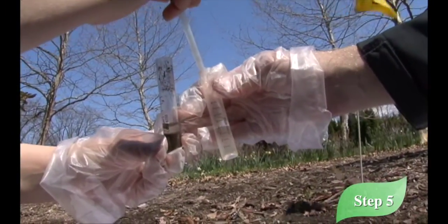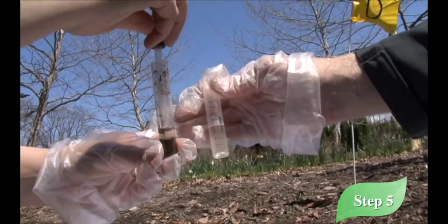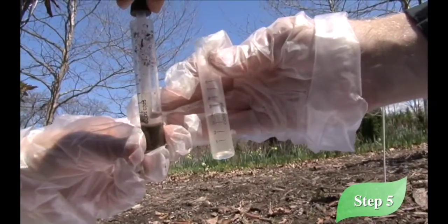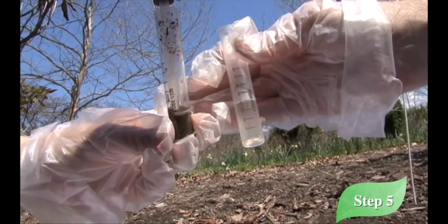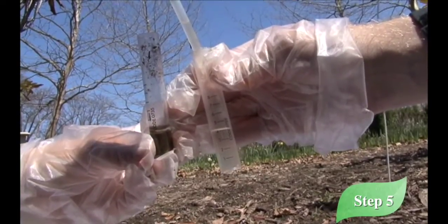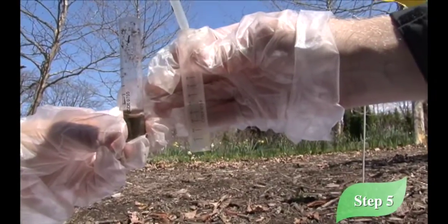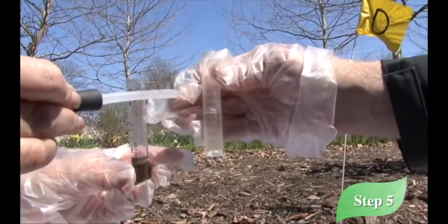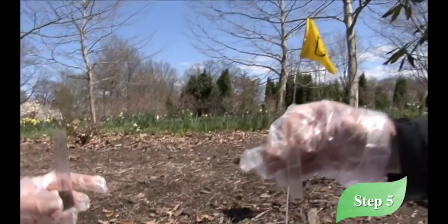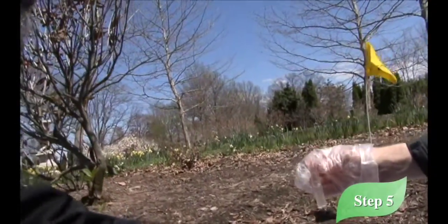We're almost to the smiley face. Gotta make sure you don't get any soil in the bottom of this one. I know, so I have to be very careful to get close to the side, but no soil. And hopefully we will hit the meniscus, or the smiley face. Wow, we just made it. Perfect. Remember, you have to look at it at eye level so that you can see that it's 5 mLs. Yep. All right, I'm going to recap and put this aside.